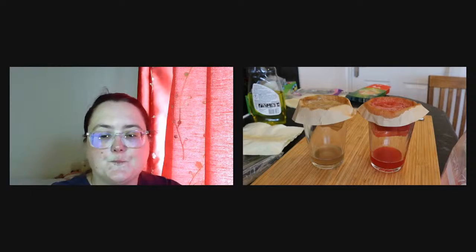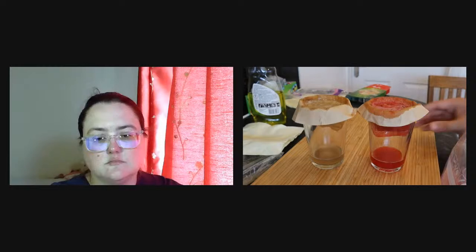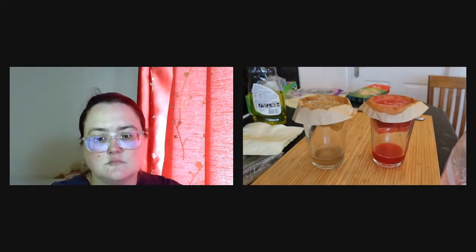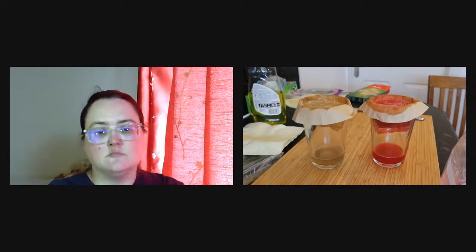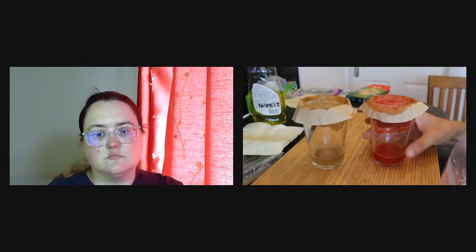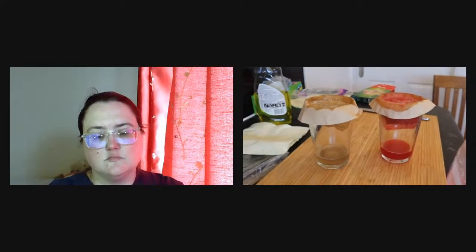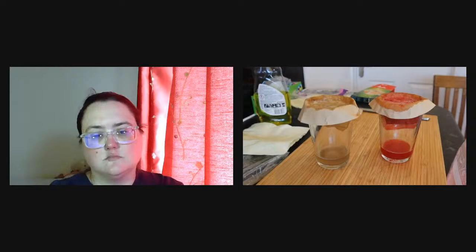Remember that we are not yet ready to extract DNA, and so at the moment what you have in those solutions is actually a mixture of the various components that are within the cells, not only DNA but also other things such as those pigments. So this is usually probably the slowest step that we have in this experiment.